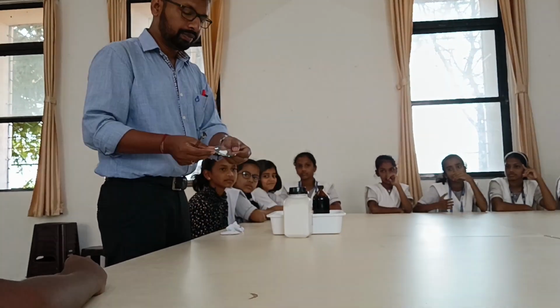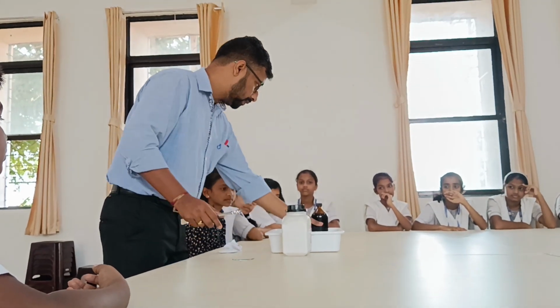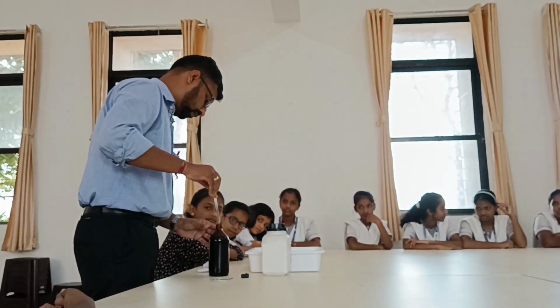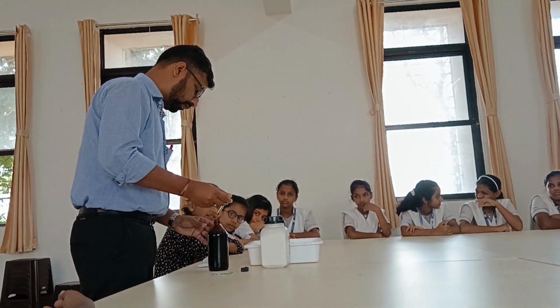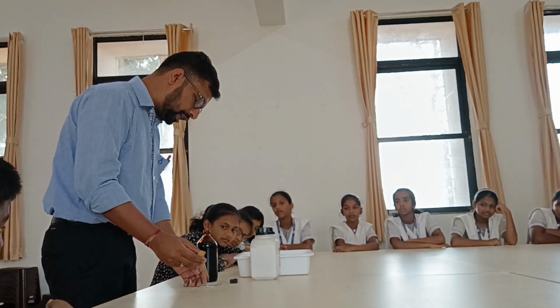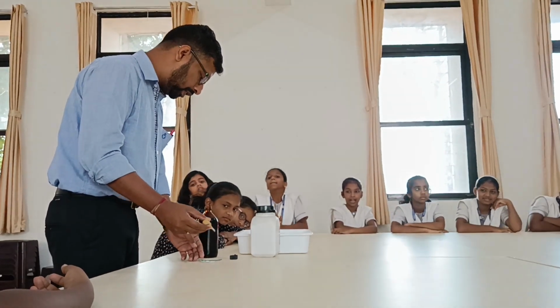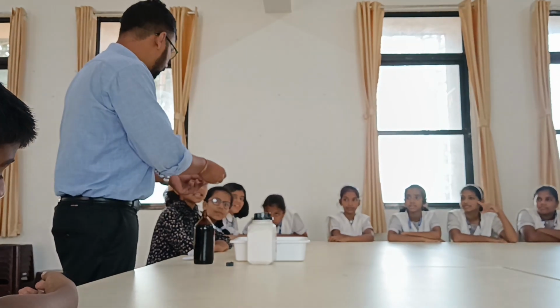Can you see the color? Yes. White in color. Okay. Can you see the color of the iodine? What is the color of the iodine? Brown. It is brownish in color. Let us see now what happens if we put a drop of it on the starch. Can you see? It has turned bluish black in color.